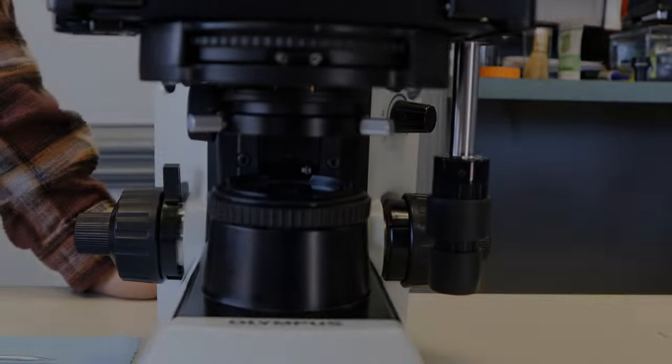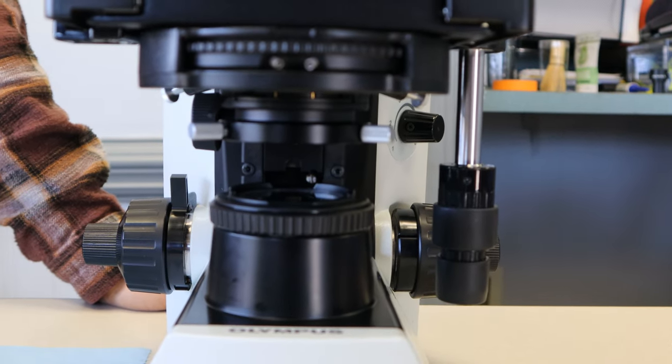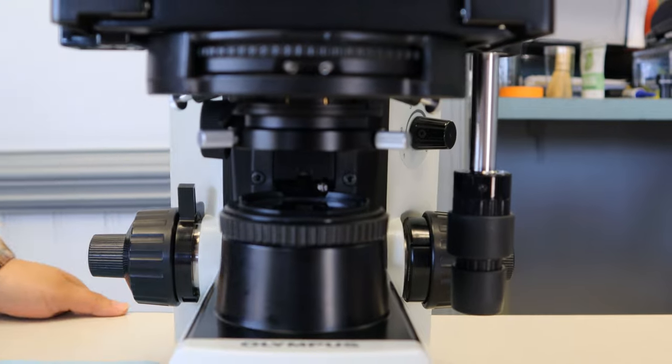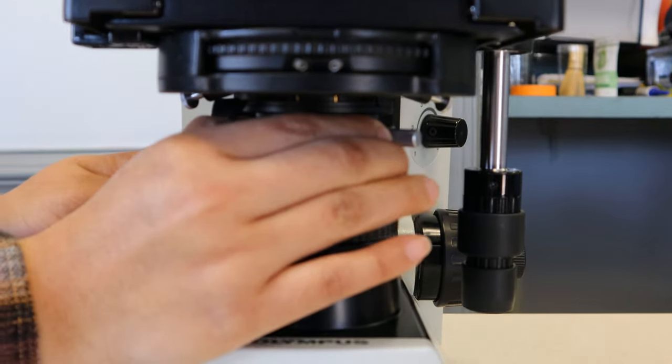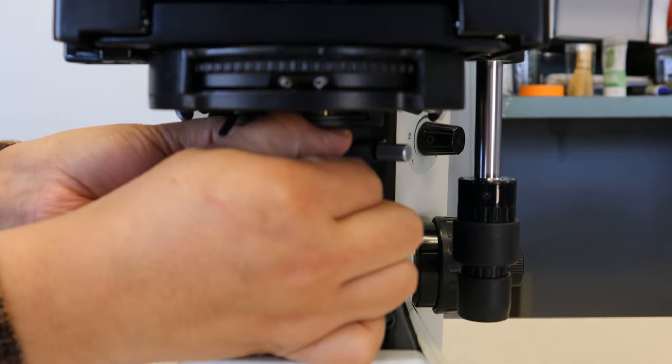To start off, we're going to remove the lower portion of the condenser, the little black ring with the two silver screws. Just give it a little wiggle and it'll pop right out. It's just pressure fit in.